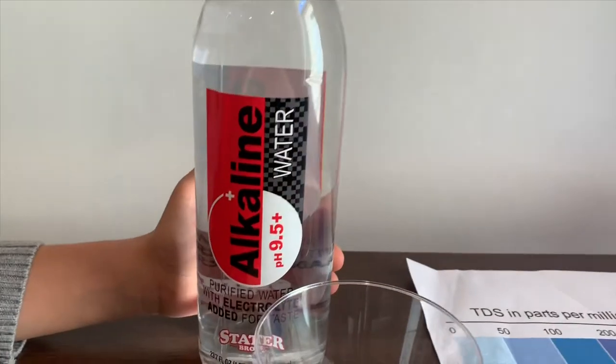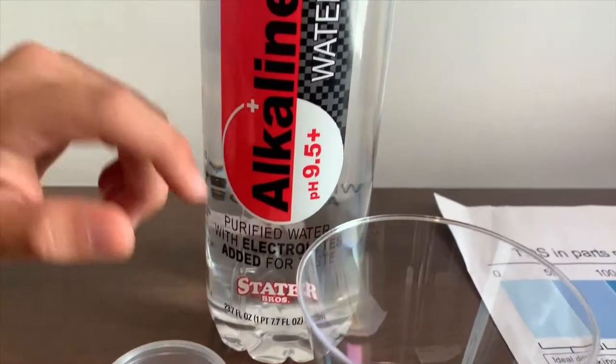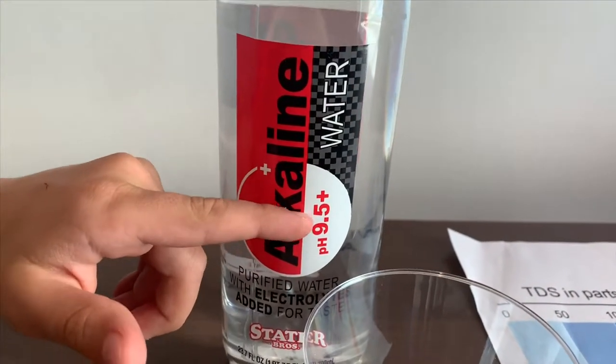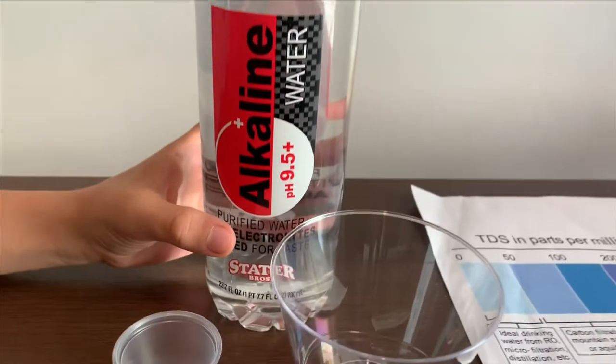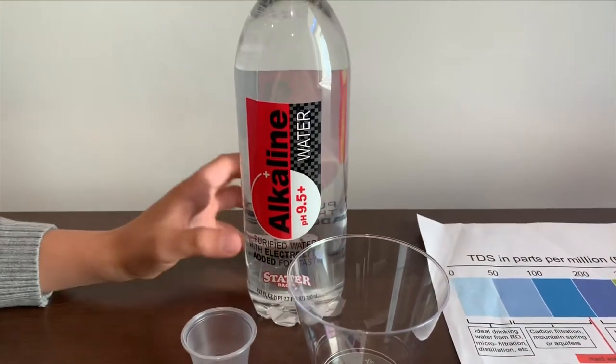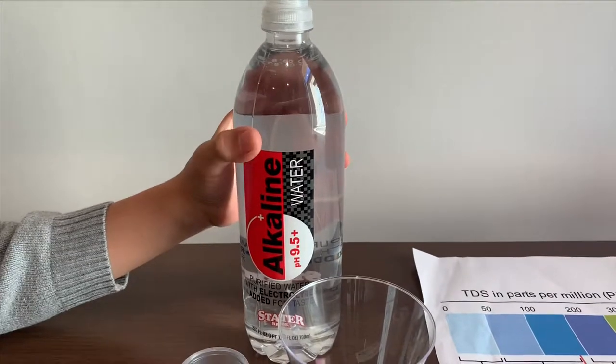This is Stater Bros Purified Alkaline Water. It says the pH levels are supposed to be 9.5 or higher. It's enhanced with electrolytes added for taste. Let's test the pH and TDS levels.